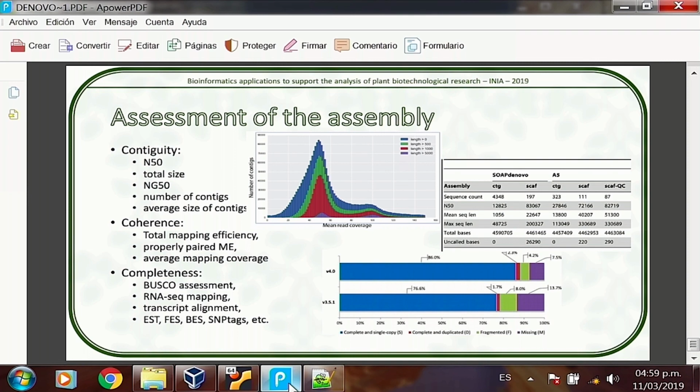Other algorithms you know for aligning things would be BLAST, for example. But have you ever tried to run a BLAST of 10,000 sequences online? How long does it take? It takes forever. There is no way you can scale to this level of millions of reads towards one big genome in such a short time using an algorithm like BLAST. That's why they had to come up with a new algorithm, or reuse an algorithm that already existed, in this case the Burrows-Wheeler transform, in order to make the alignment faster.